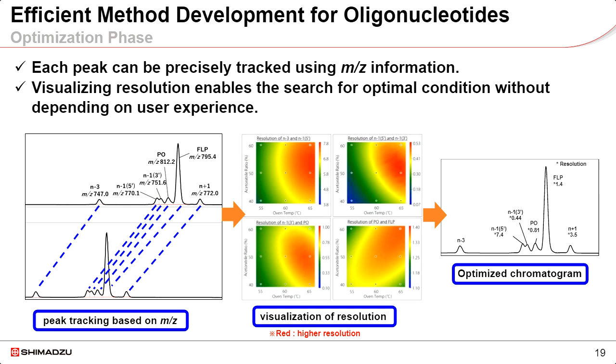When we allow for the use of LabSolutions MD, we don't have to run every possible combination of conditions to try and target the ideal condition. We can use the concepts introduced by central composite design to choose points and interpolate between.